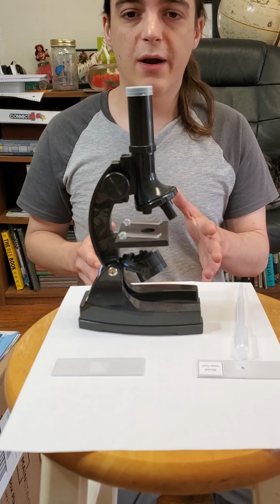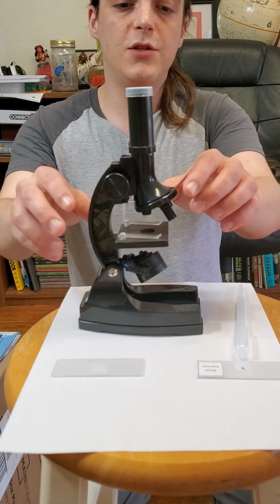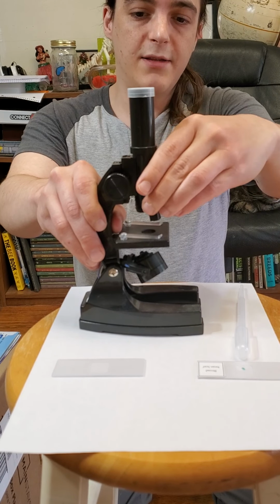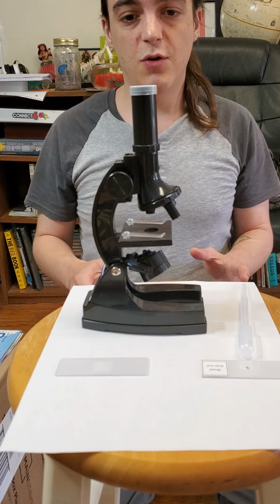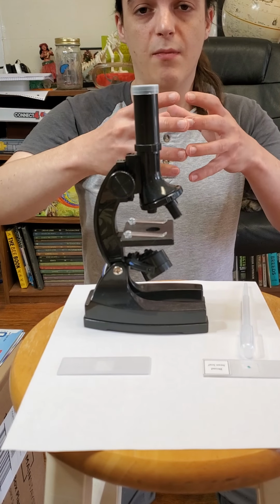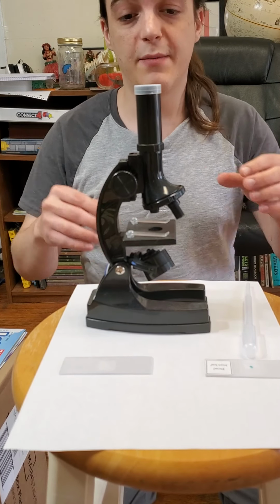The basic microscope has a whole bunch of parts. The typical microscope is going to have your eyepiece, where you put your eye to look down into it. You've got your lenses, and usually a little slider that can change between different lenses. Here I've got a 150 times zoom, so when you look through that microscope, it is magnifying whatever you're looking at, making it look 150 times bigger.